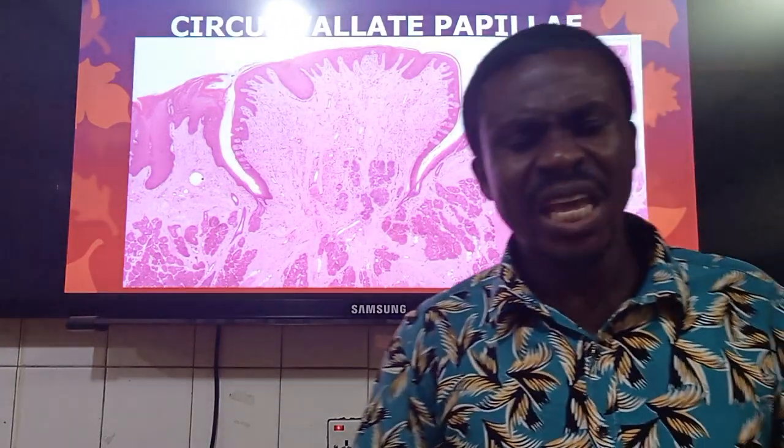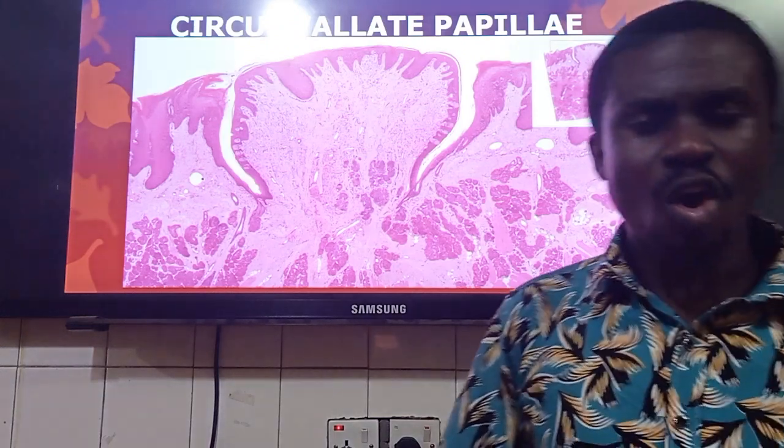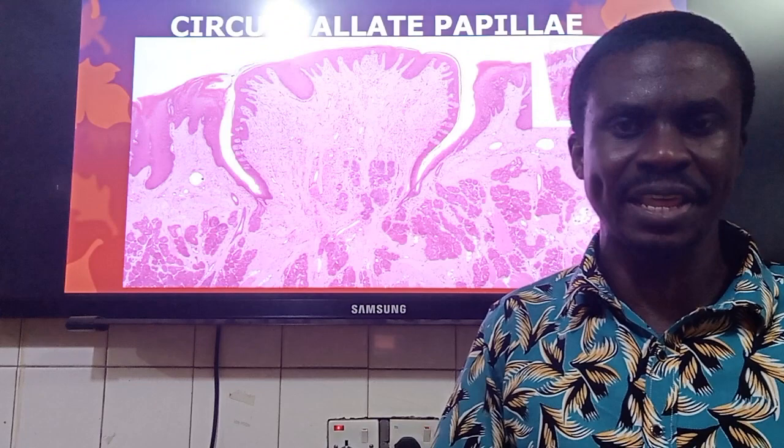Okay, so now let's look at it. There's another papilla I want you to know. And my friend, this time around, this is the circumvallate papilla. Now, these are the largest papillae. Of course, they will also have the maximum population of taste buds.